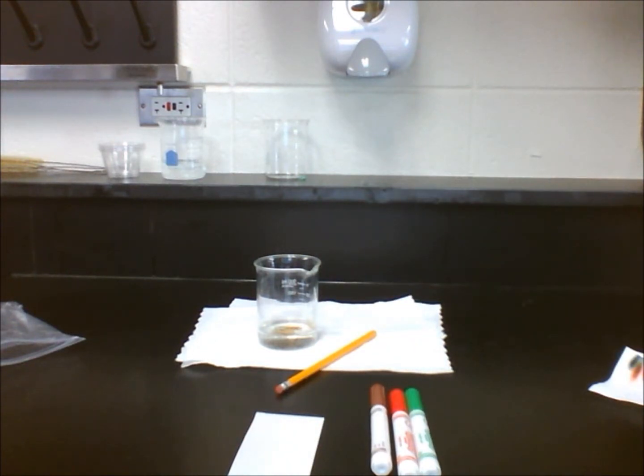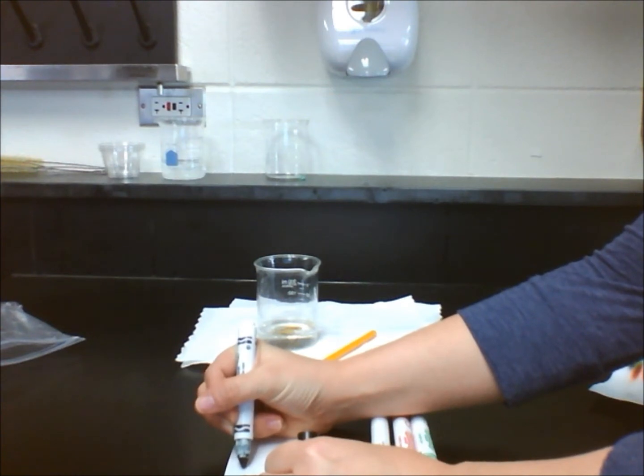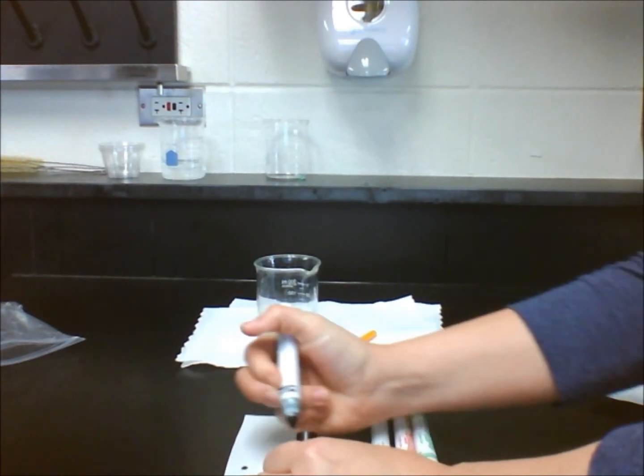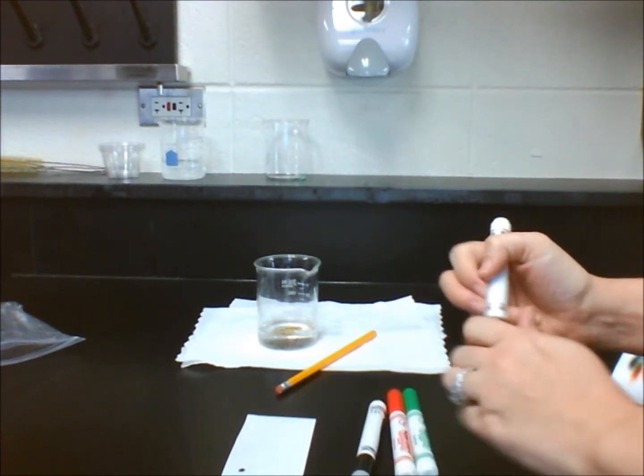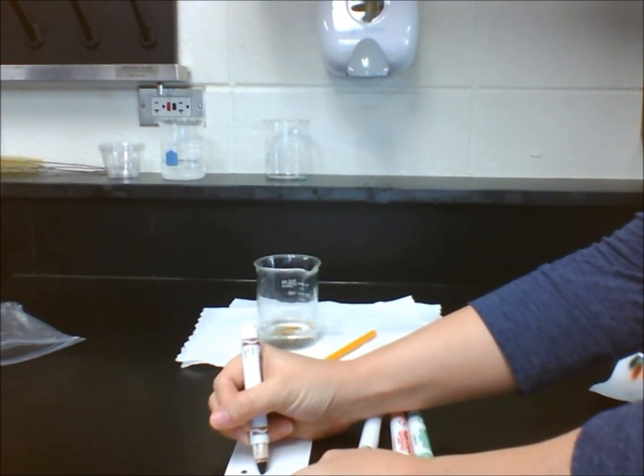Step 1: Pour 50 milliliters of water into a beaker. Step 2: Place a spot of green ink, red ink, black, and brown ink about 2 millimeters in diameter on a piece of chromatography paper one inch from the bottom.